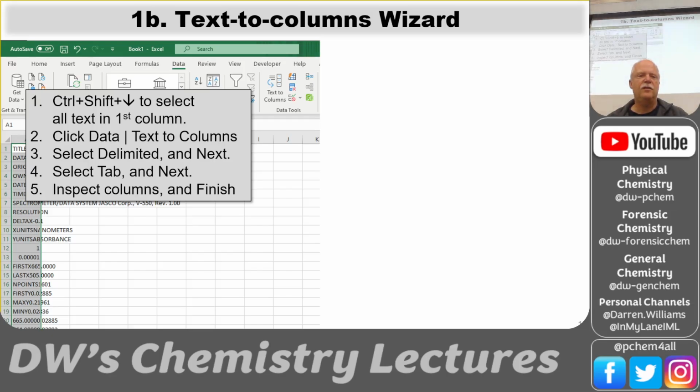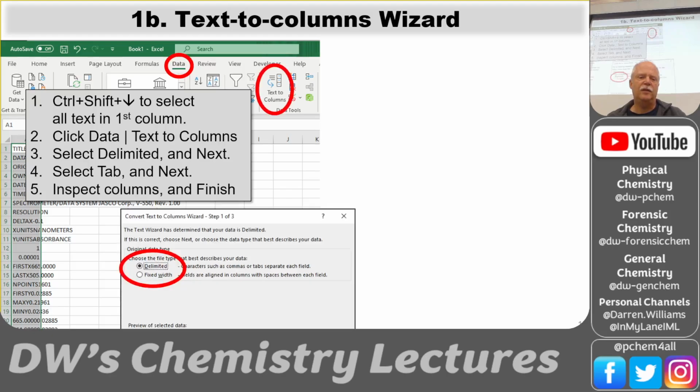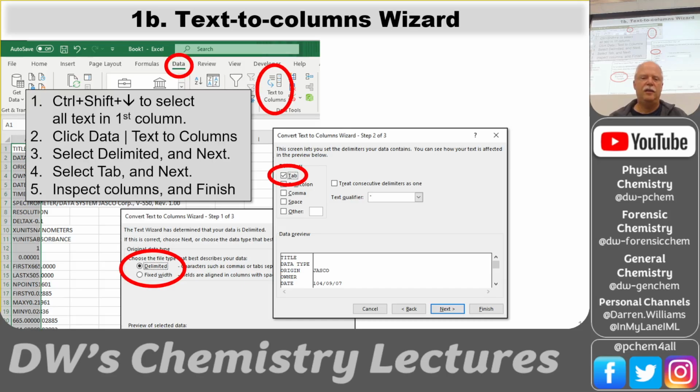But so we have this. Again, my little shortcuts: you click on the top cell of the column, and Control-Shift-Down will select the whole thing, all the way to the bottom. Then you can click the Data ribbon and do Text to Columns. And you want to pick Delimited. This is a tab delimited file.